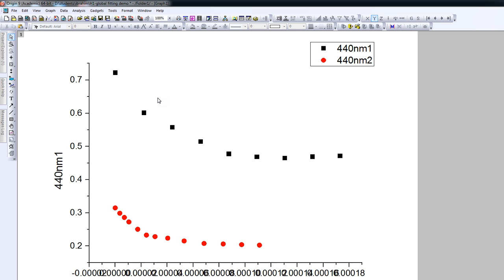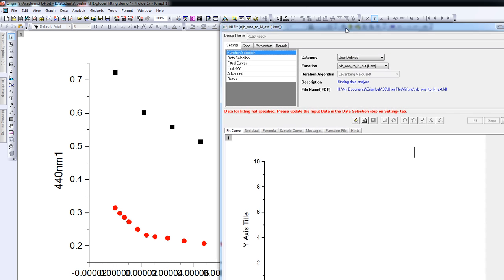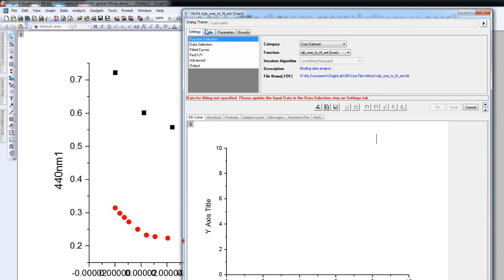What we want to do now is we want to analyze the data. So we go to Analysis, then to a non-linear least squares curve fit. This opens up a window called NL fit. Because I've used the equation before, the equation has already been loaded. You could add a new equation here, but we want this particular model, which is an extended 1-to-N interaction model.